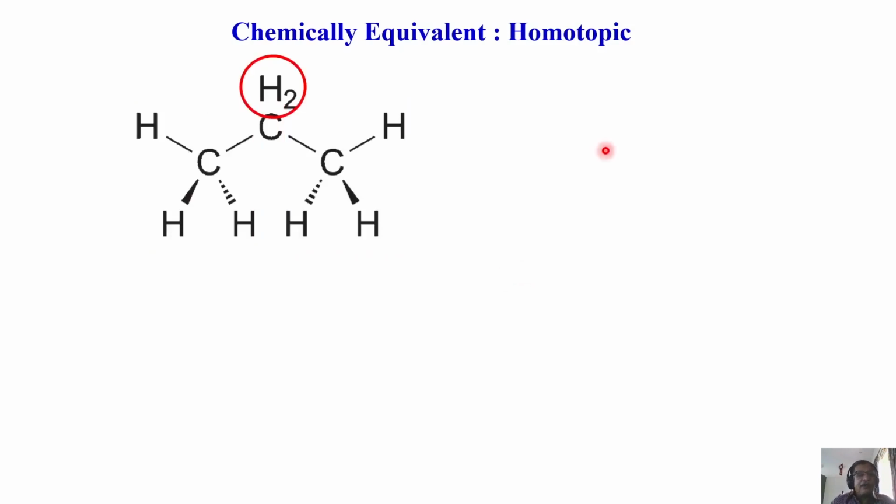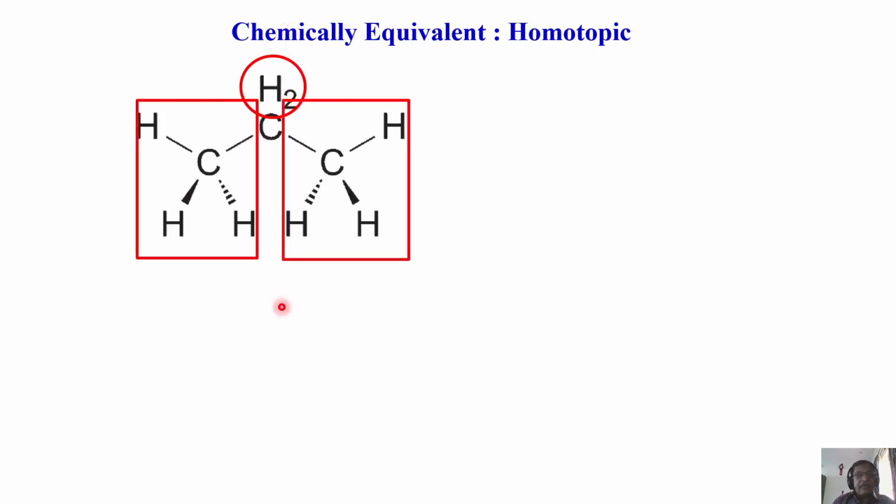Look at this molecule. There is a symmetry axis along this, and this CH3 is equivalent to this CH3, whereas this CH2 is different. So what does it mean? We get 2 different types of peaks for proton, and these 2 methyl groups give a single peak.